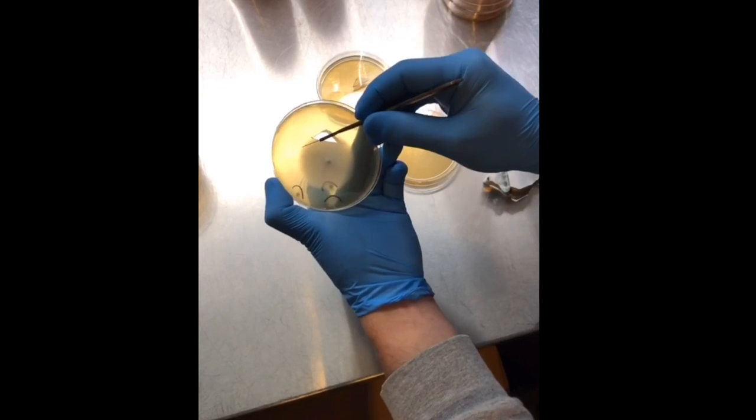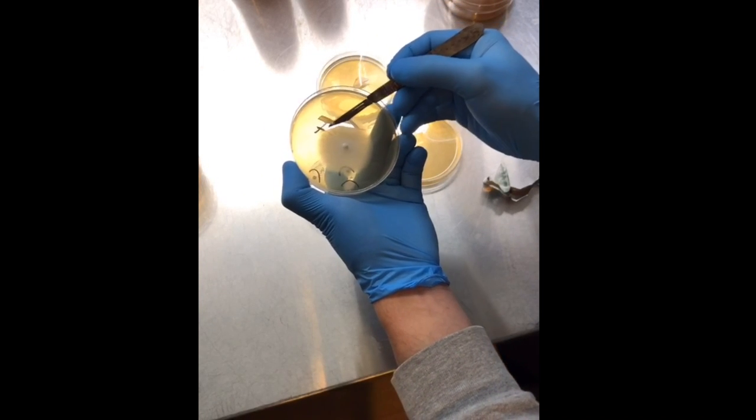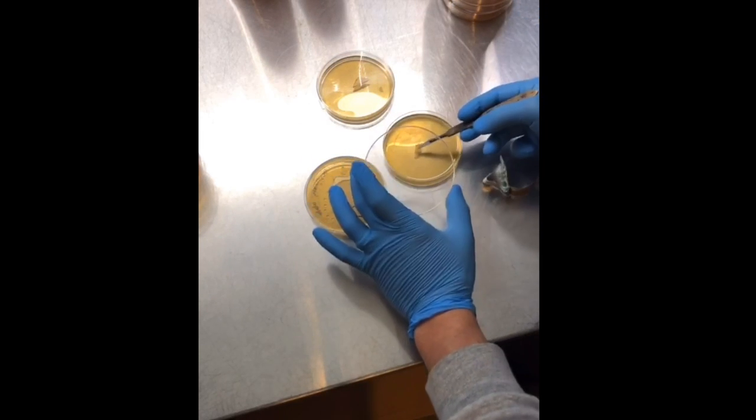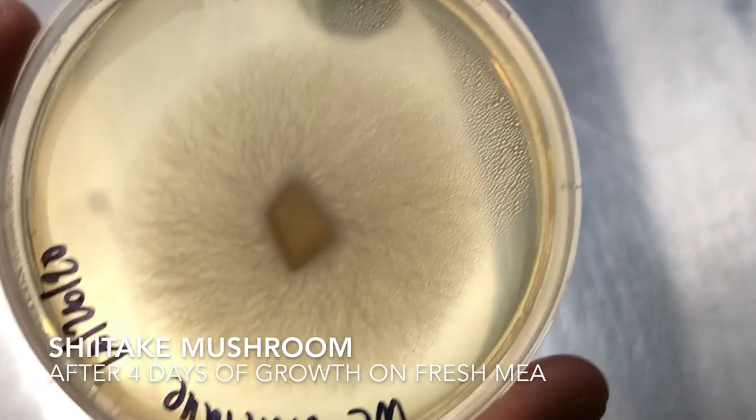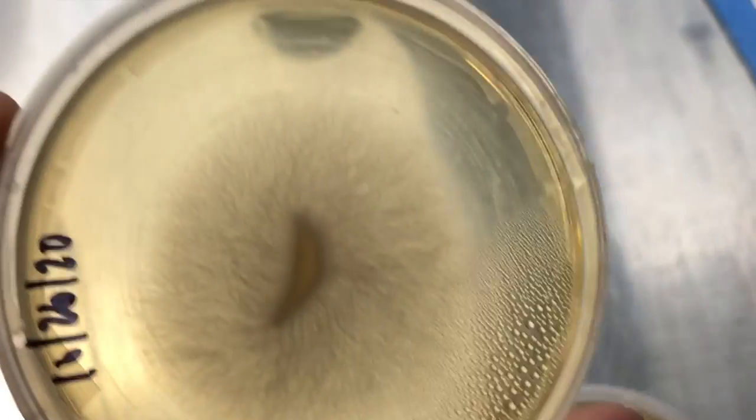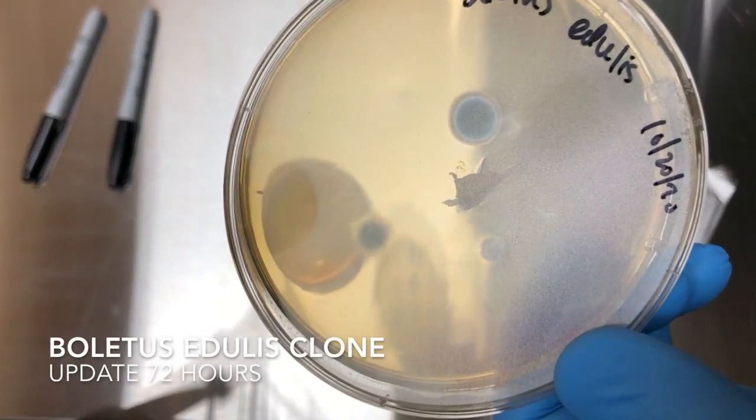Repeat until you get a clean mycelium culture. Here's that shiitake after four days on the plates — we've got some nice clean isolated shiitake. Really excited to try this variety; hopefully I can get a faster colonizer. Right now the one I have takes about six weeks, so I'm hoping for some speedy mycelium.